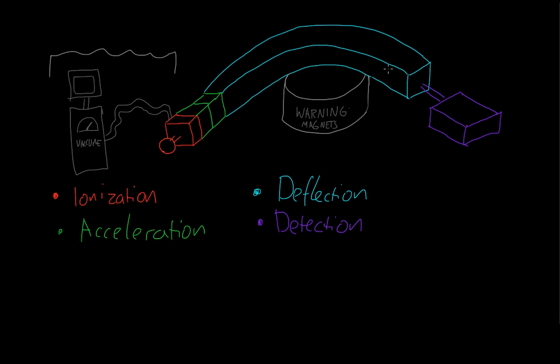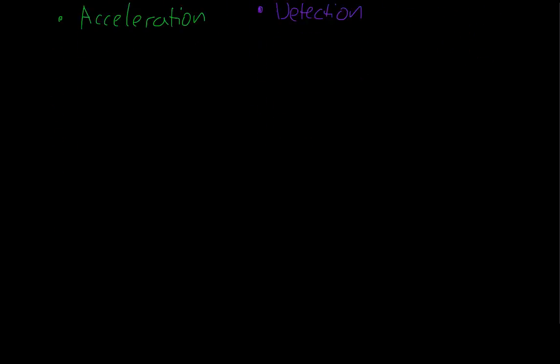And we would have several beams of ions going all in different directions because of the charge from the magnets. So then the detection chamber is where these ions are detected. If they just hit an empty wall, we wouldn't know that they were there in the first place, so what would be the point in having it? But no, what happens is our ions come into contact with a metal wire.